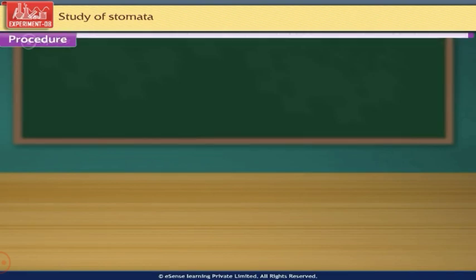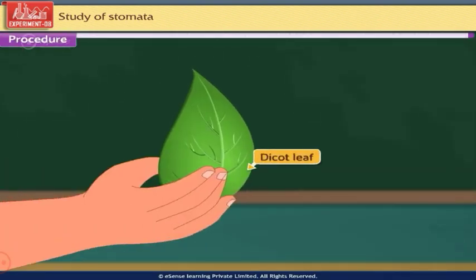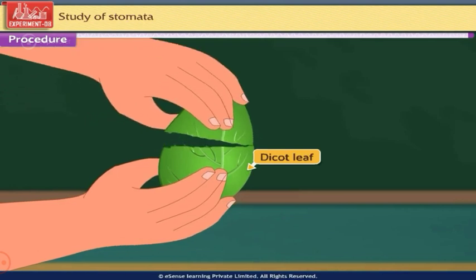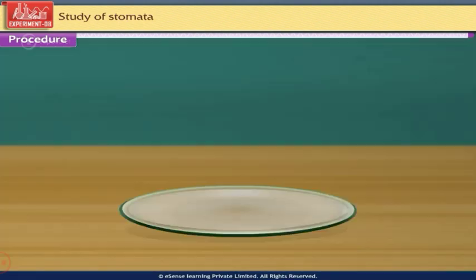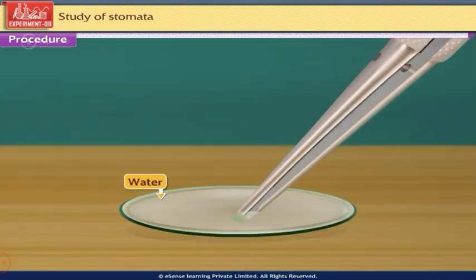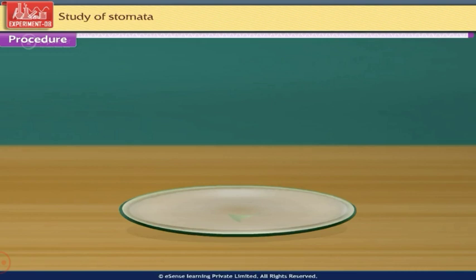Let us now begin with the experiment. Take a dicot leaf and tear it. Get a thin peel using forceps. Keep the peel in a watch glass containing water. Put a few drops of saffronine stain in the watch glass.